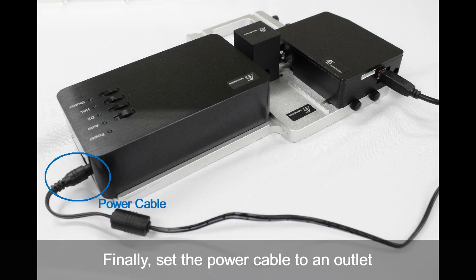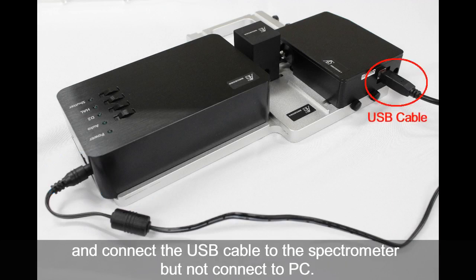Finally, set the power cable to an outlet and connect the USB cable to the spectrometer, but do not connect to the PC yet.